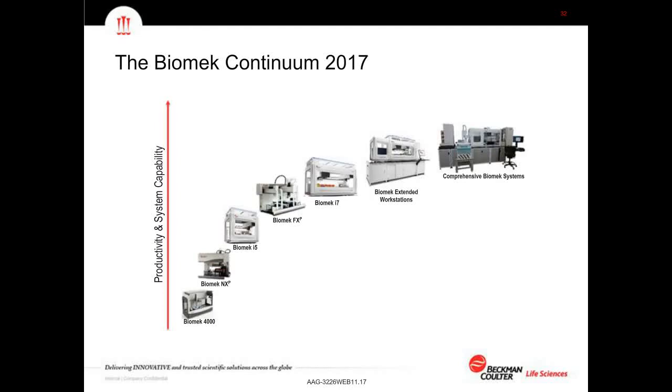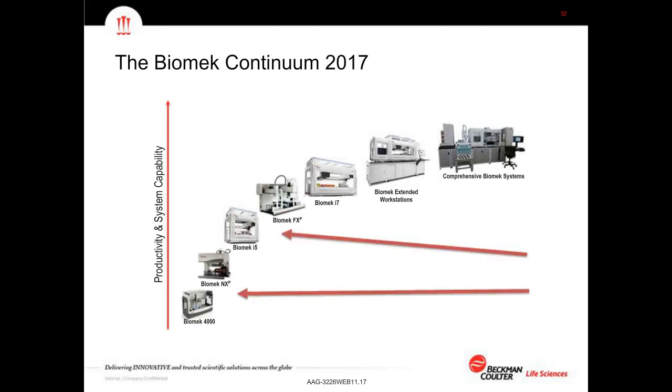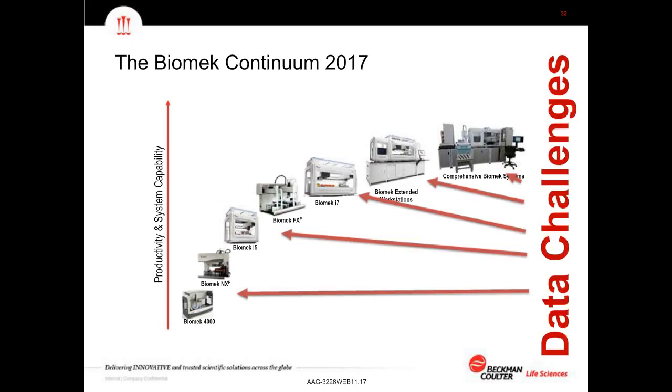To repeat Russell's slide here, looking at the continuum of liquid handling and automation products that we have, I want to start pointing out where some of the data challenges come in. And the data challenges come really at every level. Handling data is not something that occurs only at the most complex cell processing systems, but even in individual hit picking, in seeding or feeding operations that are done even at the entry-level automation systems, we still have those data management challenges.